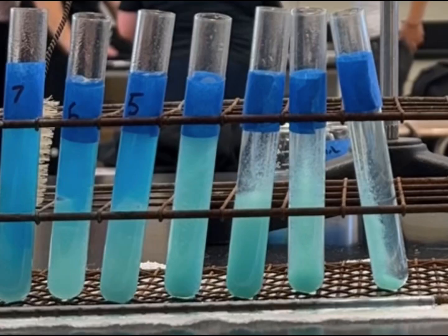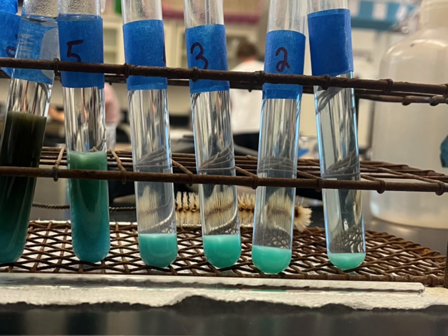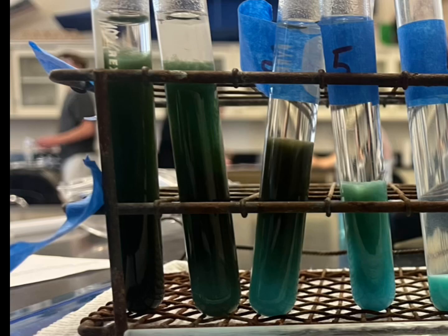After the reaction happened, we saw a gradual increase in precipitate from test tubes 1 through 4, while also having a light blue color. In test tubes 5 through 8, the precipitate started to level off and the color became darker as it went on, with test tubes 7 and 8 looking almost black.